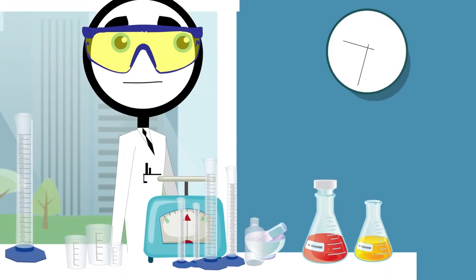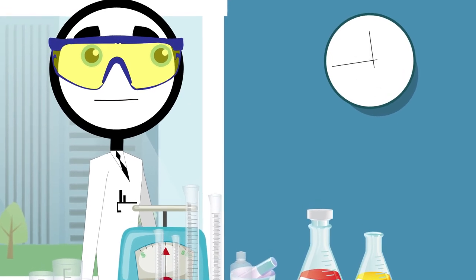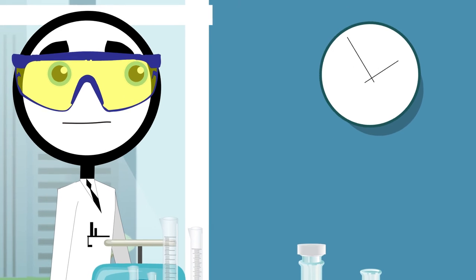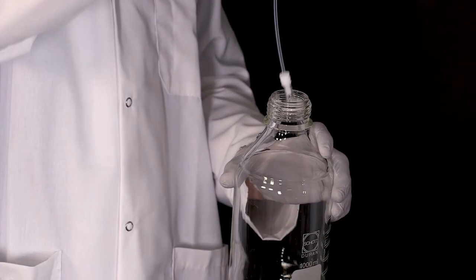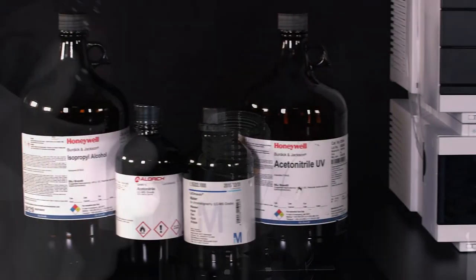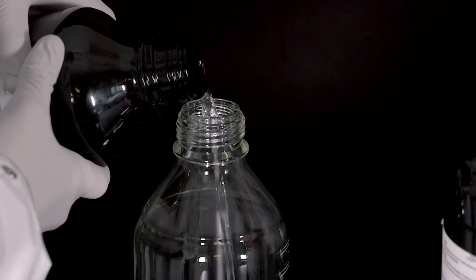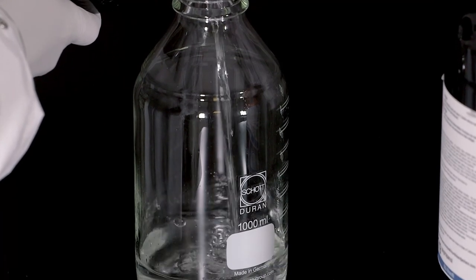Chris also went the cheap route for his solvents — he didn't buy HPLC grade materials. His low-grade solvents wreaked havoc on his instruments and slowed down his experiments. Agilent recommends that you have available HPLC grade acetonitrile and water with a dry residue below one part per million, or MS grade solvents for your LC. Isopropanol is also recommended for cleaning and storage. Make sure to use a vent hood when pouring solvents in your lab.